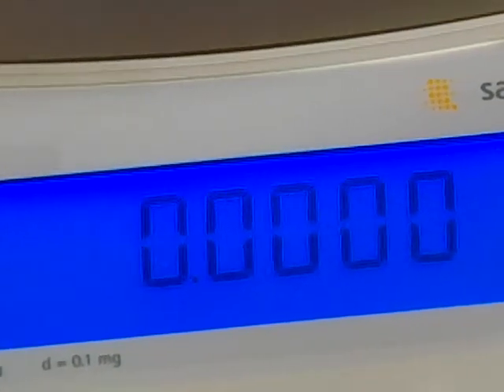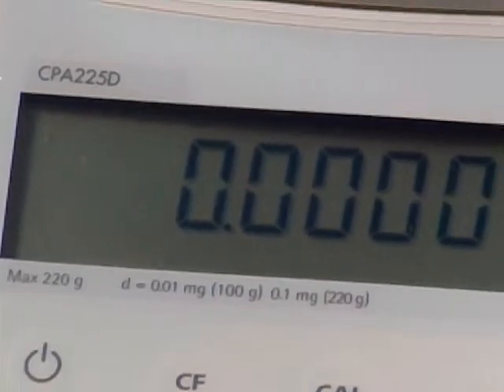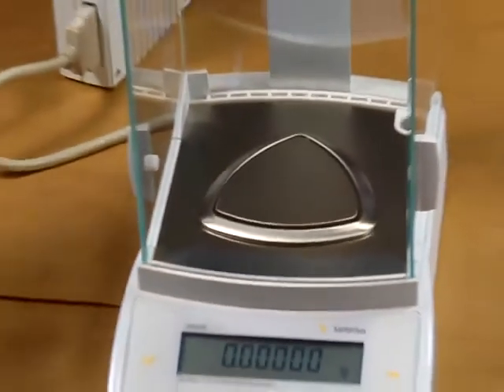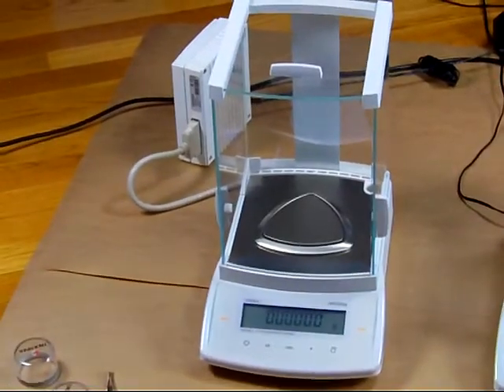The reason for this is the backlight creates electronic noise, and the CPA225D is a 5 decimal place or a 10 microgram balance. The balance is so sensitive that the electronics are external and they are in this little box right here. There's a cable that plugs into this box where your power supply goes in to power up the balance.